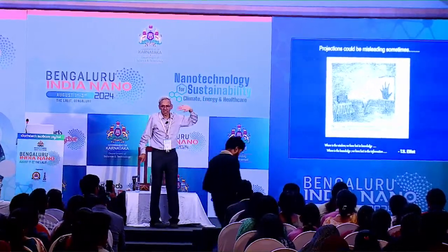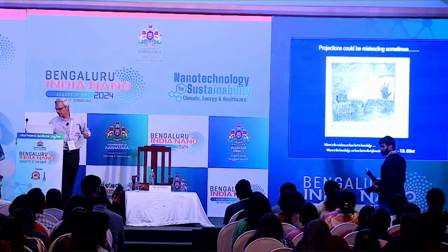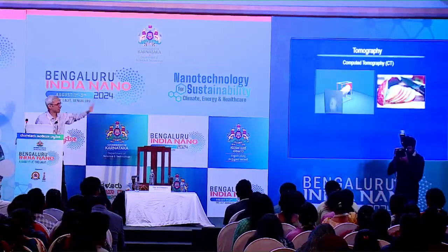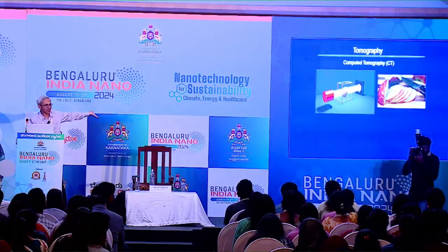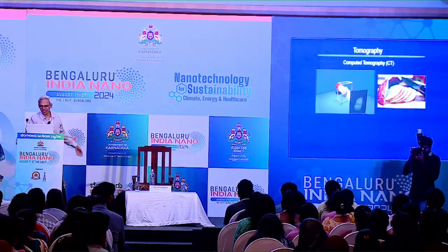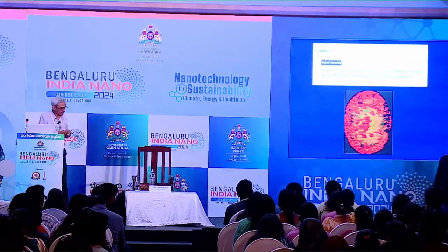Therefore, it's very important to know 3-dimensional information. In projection, things can be very, very misleading, right? So tomography essentially means you're getting slices and putting all the slices together to form the whole apple in this particular case. Okay. I'll just show you one example or 2 examples without going into the details.